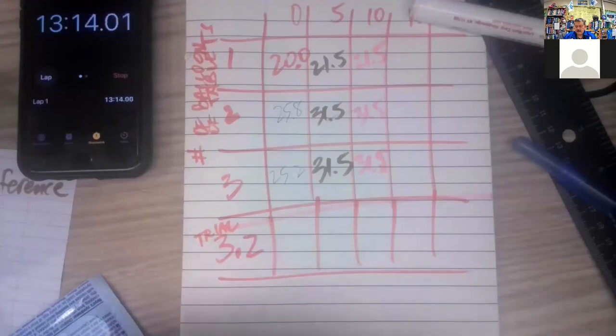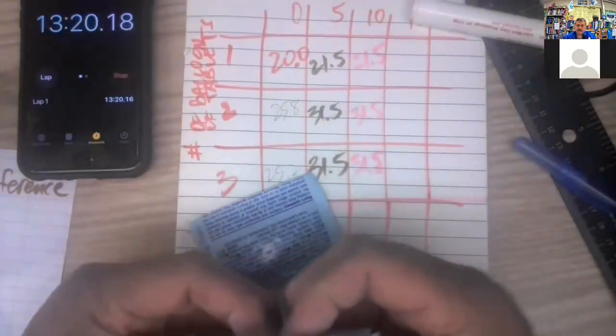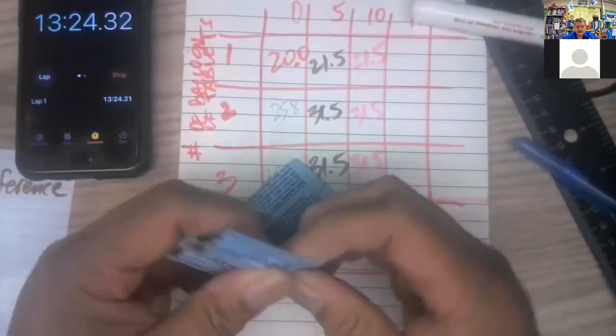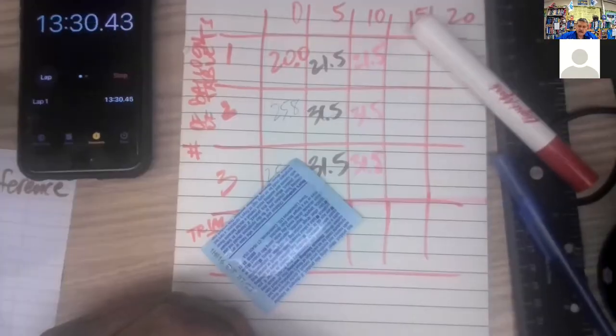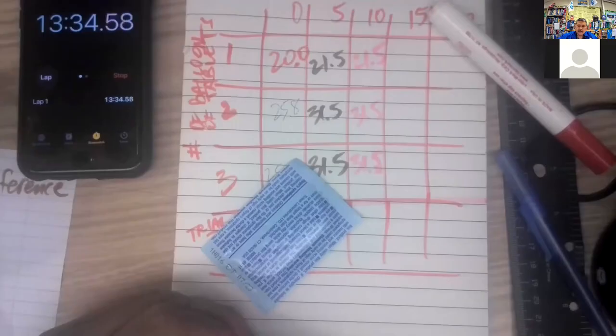Next time. I got 1, 2, 3 tablets. Snap them first. After I snap the other one, I'll crush them with the mug.